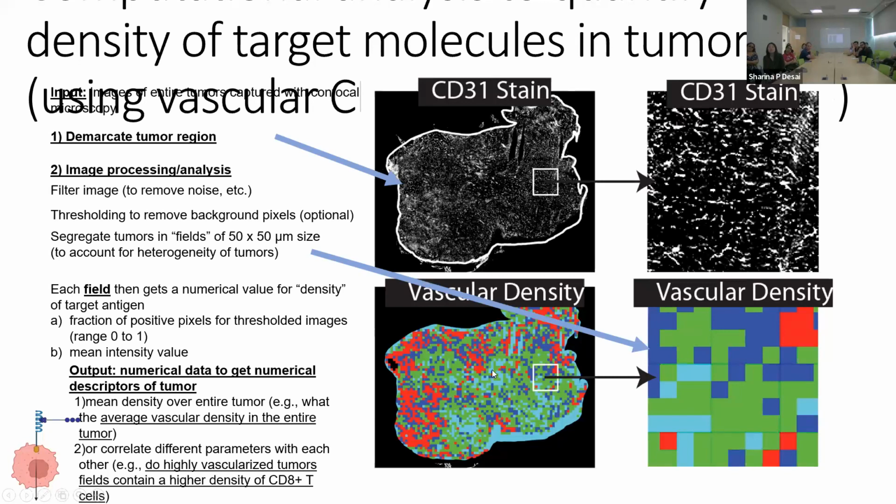It's a pretty simple approach, but it works well for my purpose. I split the tumor into smaller areas, and each of those areas gets an intensity value. That's one thing you can do with imaging, because when you do the whole tissue, you lose that information. For the microscope, the spatial information, as others have said before, is the crucial thing.